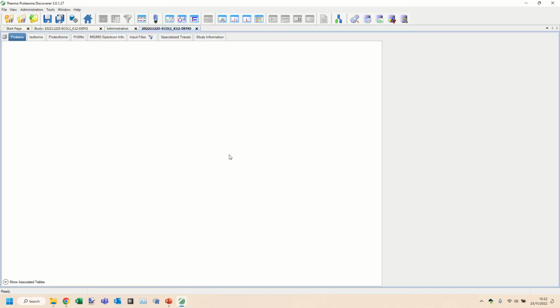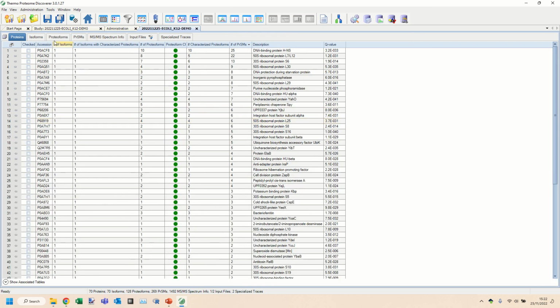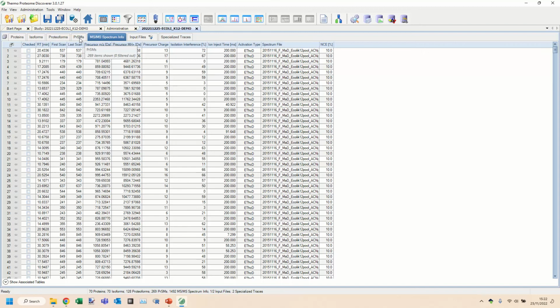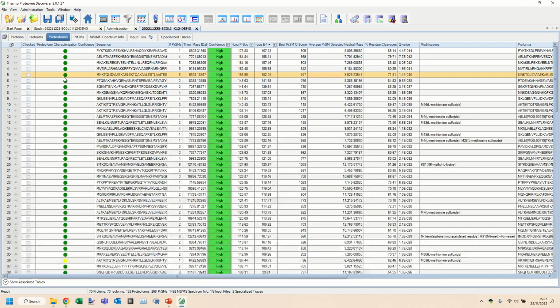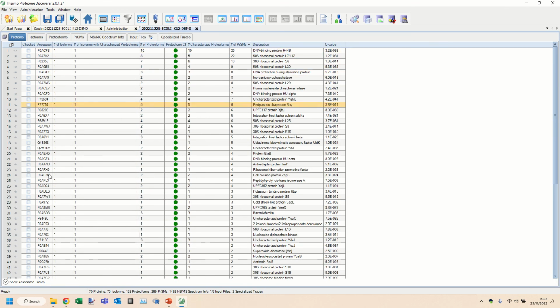It takes a moment to open it. These are fairly complex databases, but there's a lot of good information here to work with. You can interrogate your data at a variety of different levels. Maybe you're interested in the spectra that were claimed to be identified. Maybe you're interested in the proteoform spectrum matches that resulted in particular. At a higher level, maybe you want to see proteoforms regardless of how many spectra were matched to them, or which isoforms, in the case of a eukaryote, for a given protein sequence were observed. But in this case, simply looking at the accessions gives us some indication.